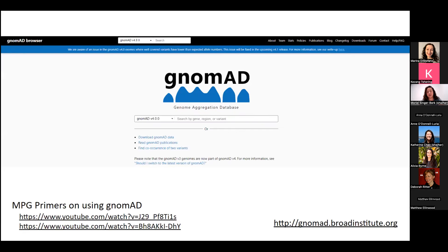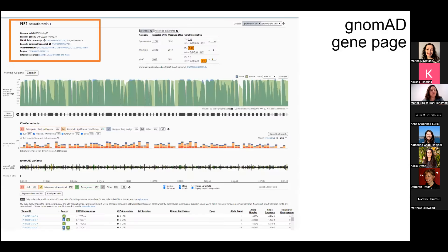I'll be using the NF1 gene as a gene example as I go through these features. NF1 is the gene associated with autosomal dominant neurofibromatosis type 1. On the gene page for any gene you type into GnomAD, you'll see some general information about that gene, including the genome build — in this case HG38 for V4 — as well as important links to resources like the UCSC browser and OMIM.